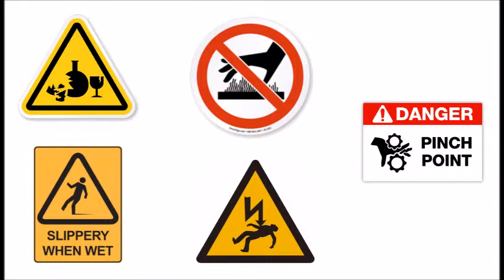The next hazard is a burn from hot surface hazard. Avoid contact with the hot surface, and in case of a burn, run cool water over the burn until the pain is gone, and cover with a loose bandage. Seek medical help for more serious burns.